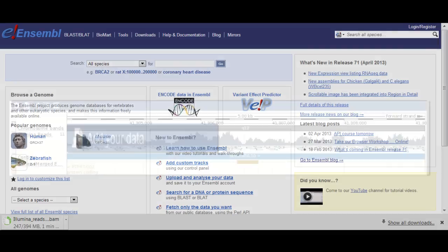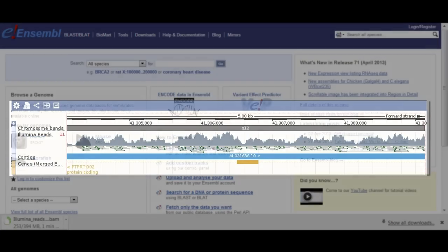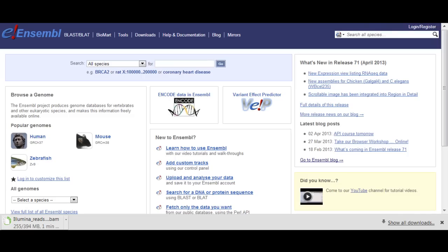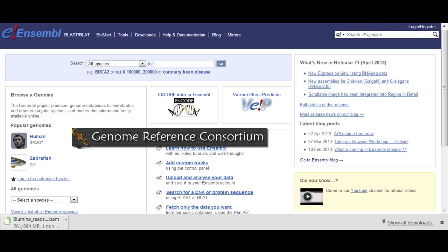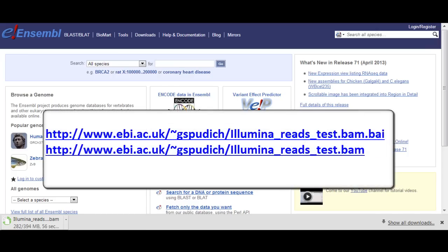I'm going to start with a BAM file and show it along the genome in the region in detail view as an example. This BAM file contains alignments to the GRCh37 assembly of low-coverage Illumina sequencing reads of chromosome 20. I'll need both the BAM file and the index file — they are at these URLs.